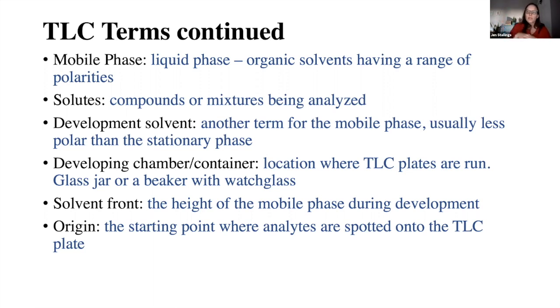Okay, next is our solvent front. Once the TLC plate is placed into the development chamber, you'll see the development solvent start to creep up the TLC plate. That's called capillary action, but it's all those vapors in the chamber that are bringing the solvent up.